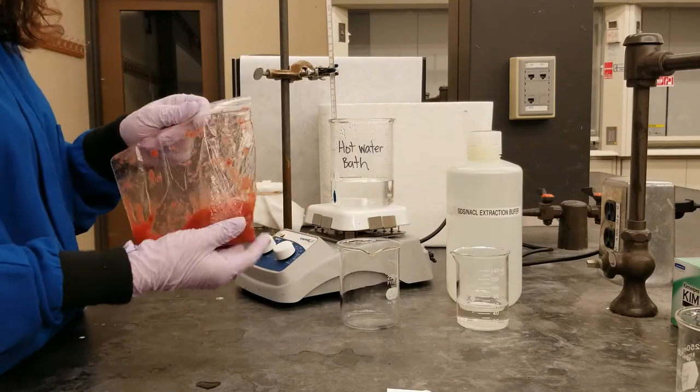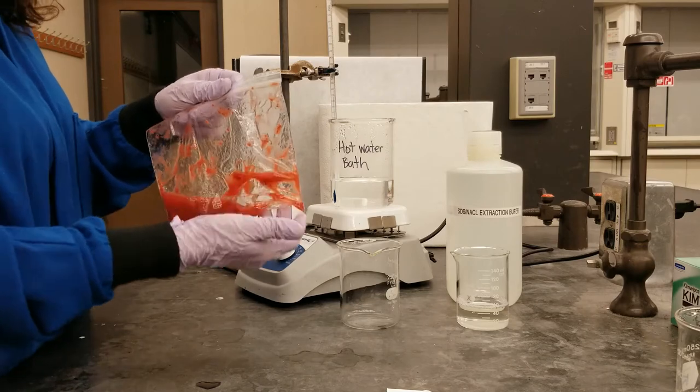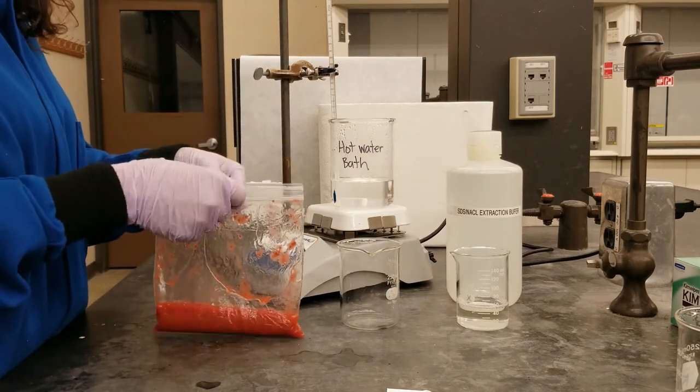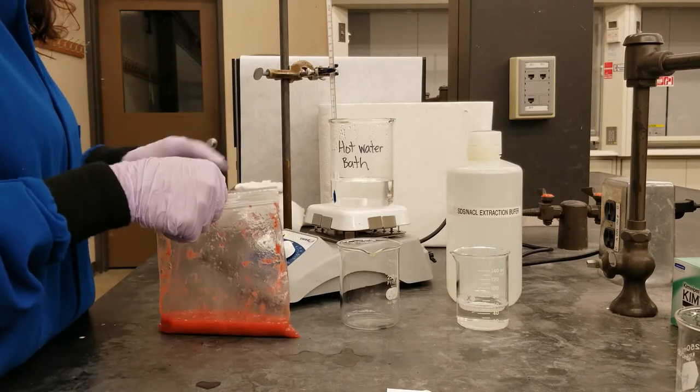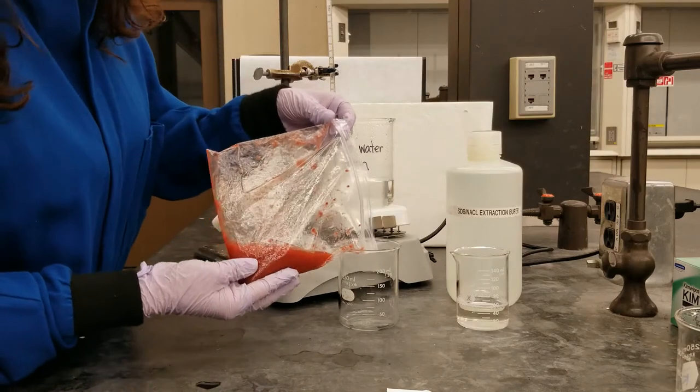So here I have a frozen strawberry mixture that's kind of slurried a little bit, and I've been smashing it for a couple of minutes now. What we're going to be doing is taking this slurry mixture and pouring it into a 250-mL beaker.